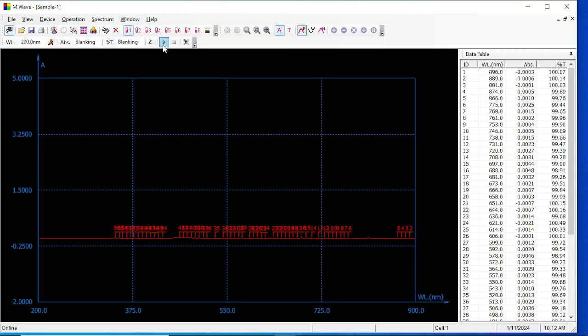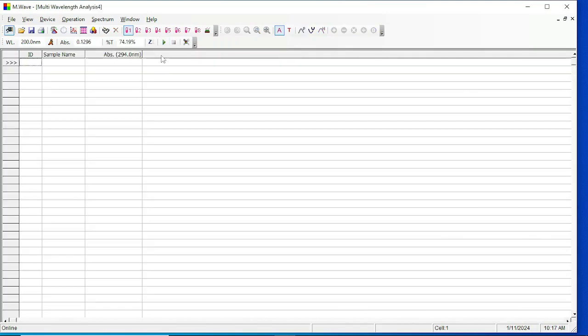Done? There are no peaks, right? Now you just load your sample. You just discard it. Load the next sample. It has to be made like this from here. Okay. Let's run this. Sir, show the graph, sir. Wow. The sample is not locked, right? Okay.